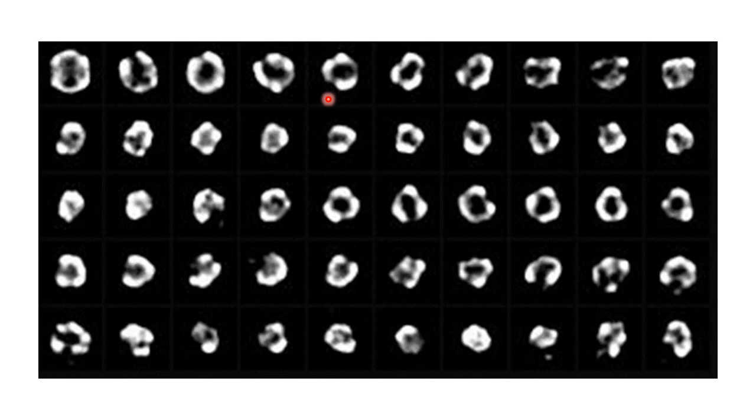Multiple images of the specimen which are in one plane are unified by using an imaging software, and then it produces a map of the electron density, and the images are unified to produce one particular orientation of the specimen.